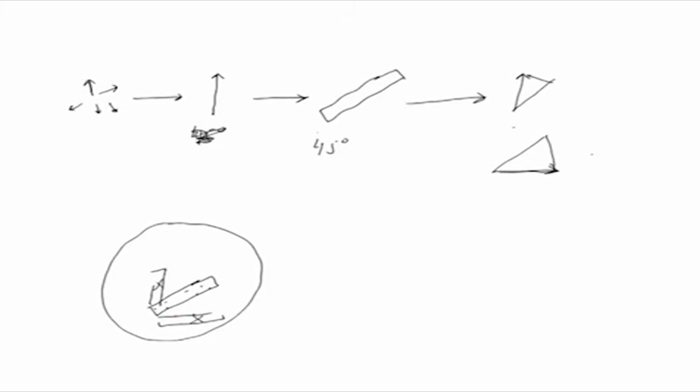So, I hope you have been able to understand how the path of light is followed, and at an angle which is different from the axis of the polarizer or analyzer, some light can pass through, with a maximum brightness at 45 degrees. So, when you rotate the rotating stage, you will encounter bright, less bright and then dark, then bright, less bright. Likewise, as the angle changes, the brightness of the image will also change, and that is how you can see the image in this particular way. So, this was to explain to you how this whole thing works. Let us return to our discussion and understand the whole thing.